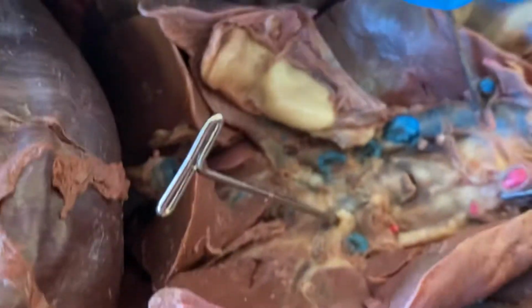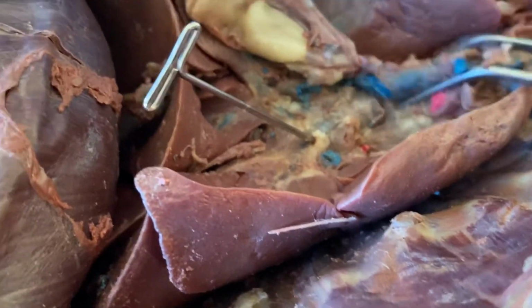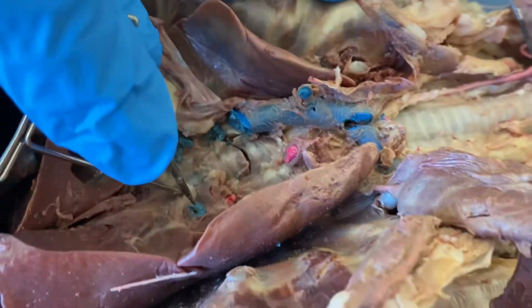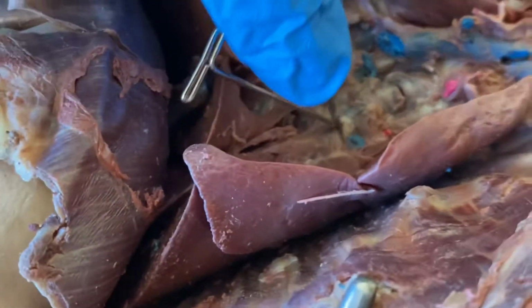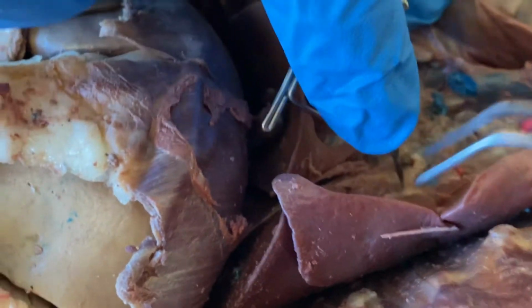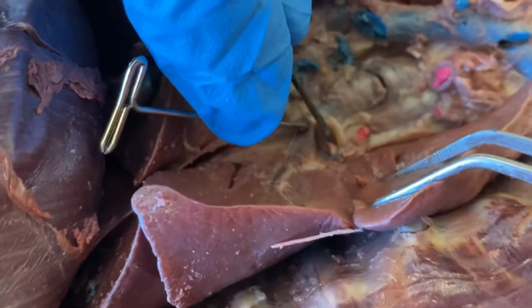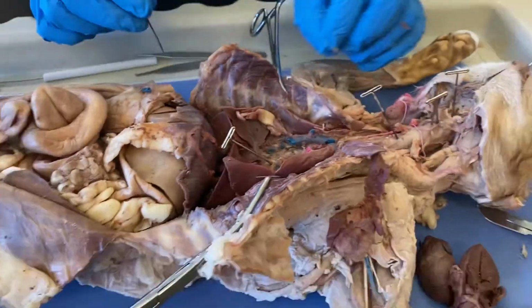Hang on, I'm zooming the camera. There we go. Right here, you can kind of see the pink from the rubber. And the pulmonary veins are also here as well. And you can see where it's also connected in here. Yeah. And here, this is a nice piece right there to see that connection, as well as there's the artery down there. Yep.